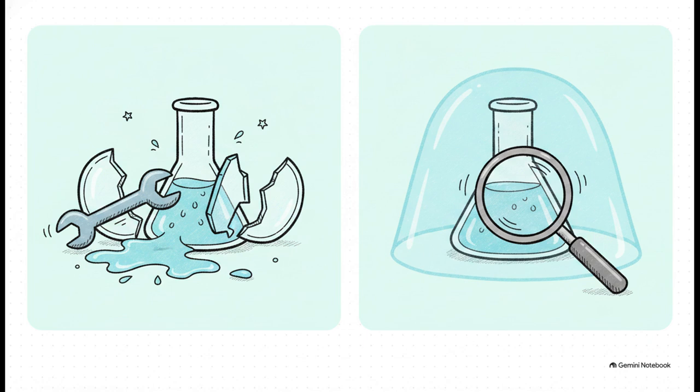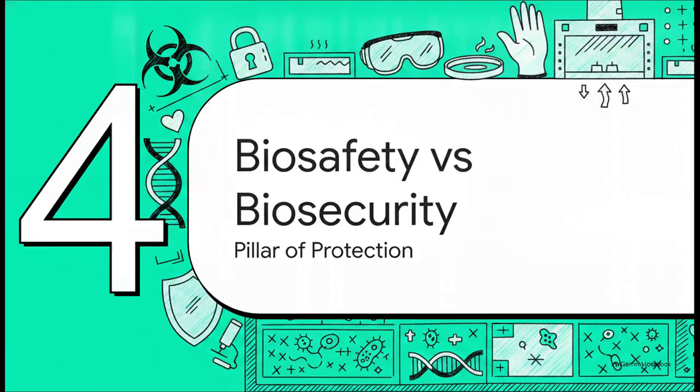It comes down to corrective action versus preventive action. If an error manages to slip through, say your QC fails, you take corrective action to investigate and fix the problem that just happened. But the ultimate goal of any lab is preventive action. That's when you identify the root cause of a potential nonconformity and eliminate it before it ever has a chance to happen.